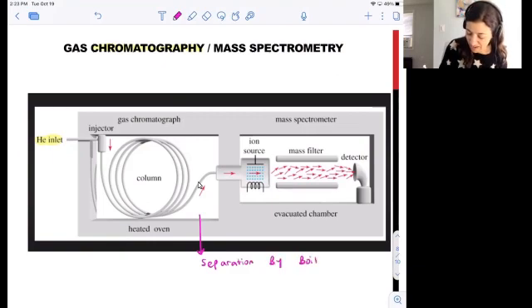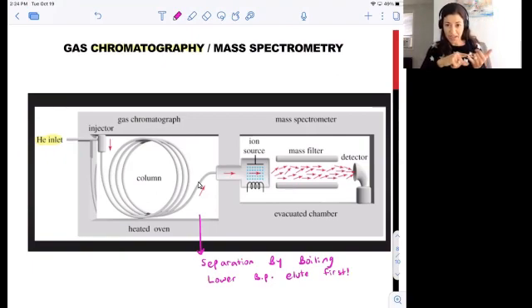So what we find is that the lower boiling compounds elute from the column first, and higher boiling compounds come out later. To prepare for this week's lab, you can look up the boiling points of hexanol, 1-chlorohexane, and 1-bromohexane, and predict the order of elution that you would expect if you had all 3 of these compounds present.